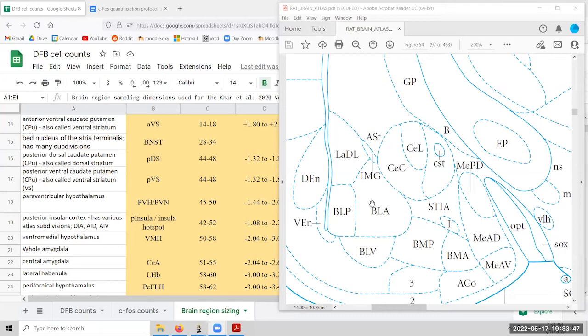Now, you might be wondering, okay, how do we even begin to figure out where to draw lines around this really wonky shape? We have some more guides to follow. One of the biggest guides here, let's get annotations back on, and maybe we should change the color to something contrasting a bit. This thing right here is a large fiber tract region that may appear in our image. We'll have to see if it's there. Another very important landmark for us to use is the optic tract over here. This goes out from being the optic nerves from the retina, optic chiasm where they connect, and then they split apart and go deep into the brain in the form of the optic tract.